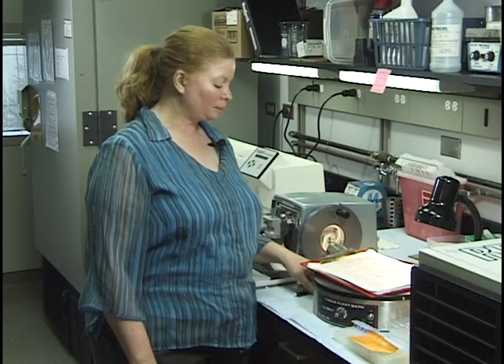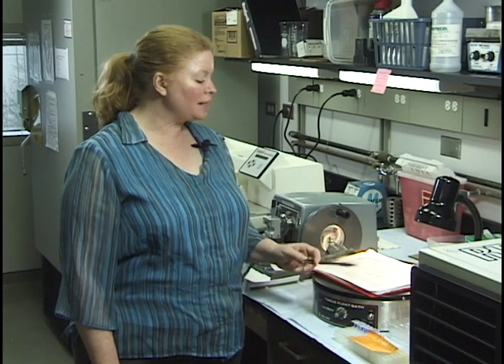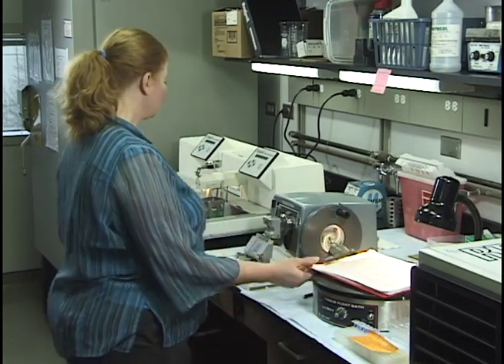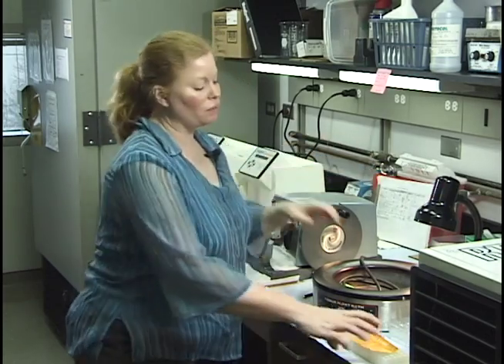I highly recommend that everybody do this with every single sample. And then you can have the date it was embedded, the date it was cut, and stuff like that. It's just a really good thing. Okay, I'm going to take these samples over to the processor, and we'll get started.